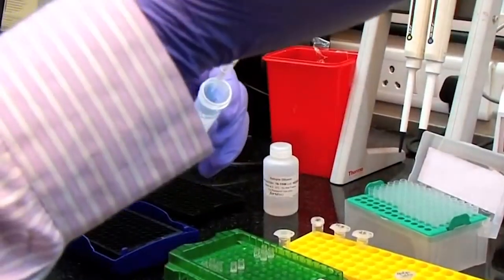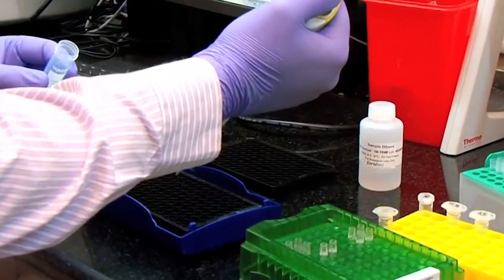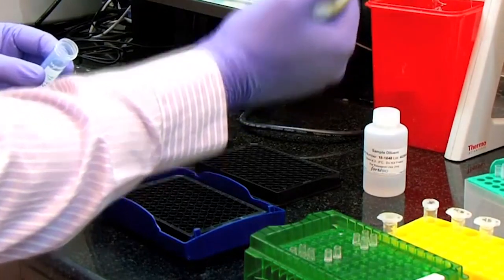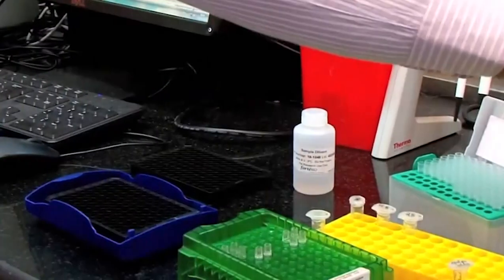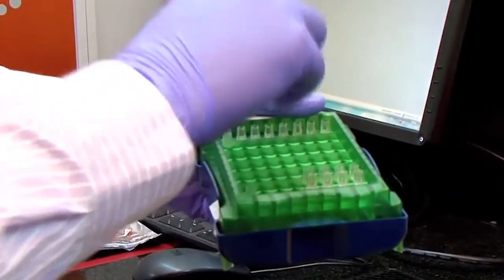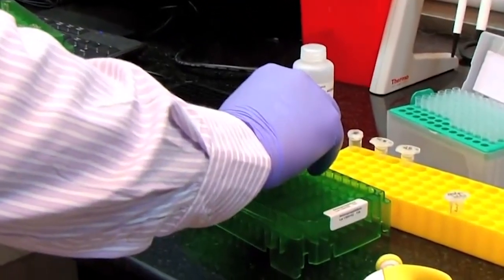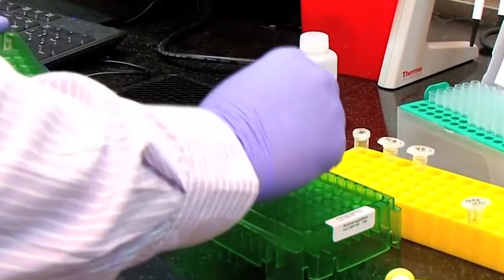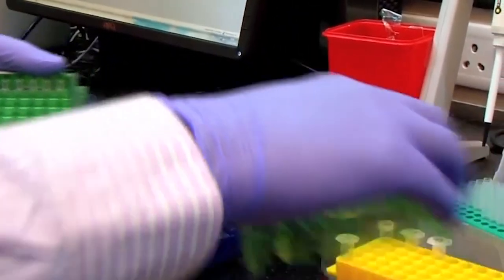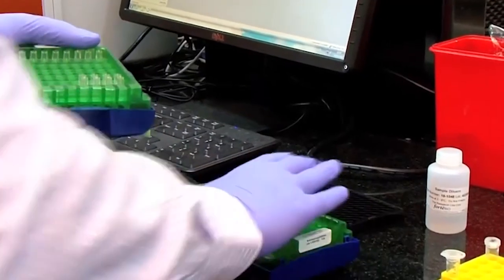What I am doing is adding 200 microliter of 1x PBS into the 96 well plate. Next I'm taking the biosensors, which are the streptavidin sensors. These are the sensors, they look like this. I'm going to put them onto the sensor tray. This is the sensor holder tray. I'm putting the sensors like this. Now I am keeping this sensor tray for hydration for 10 minutes, so I will set aside these sensors for 10 minutes.